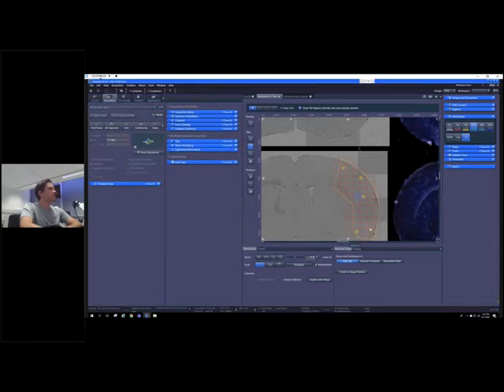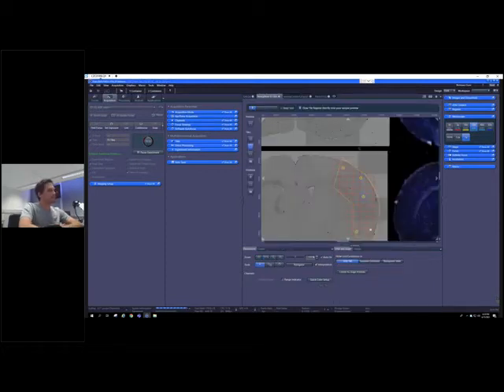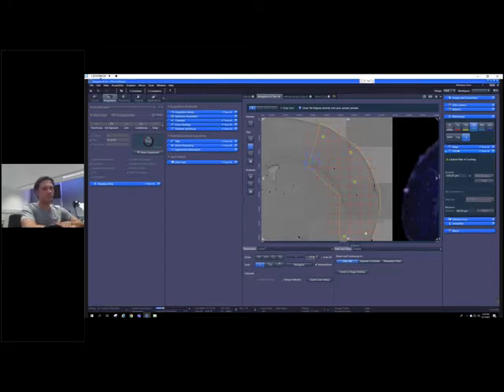So let me start this experiment and let's watch what the system is doing. As you see, initially there's a software autofocus running at the respective focus support points here. You can see the stage is moving to the yellow dots here in our tile region, executing the software autofocus, what you can see here indicated on the left-hand side. And now just running a quick tile scan, and I'm extrapolating all the different Z planes according to the support points which we have distributed.